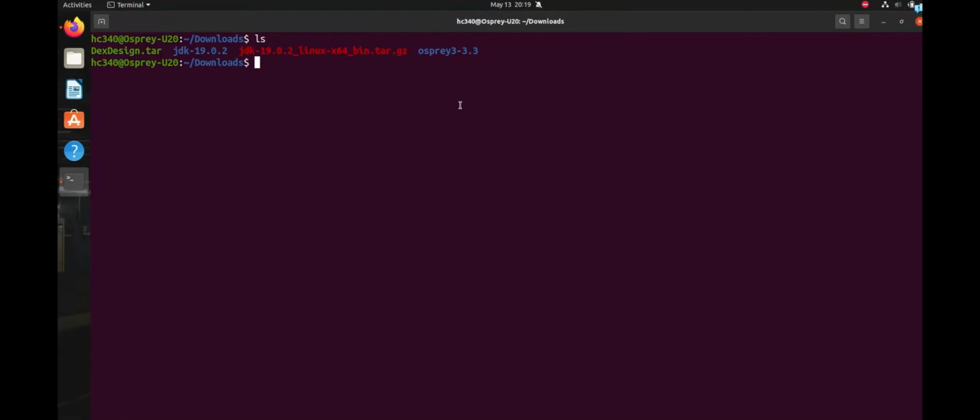All right, welcome back. Now that we've downloaded and installed DexDesign, we're now ready to prepare a file. If you haven't already, run through the master protocol that's described in step 1 of the JCP protocol in order to generate a D-peptide in complex with an L protein. Once you've done this, you can obtain it and save it to your desktop. As you can see, I have it here. I've saved it here as match4.pdb.